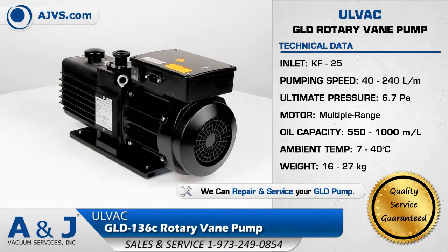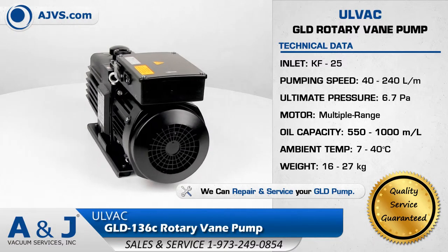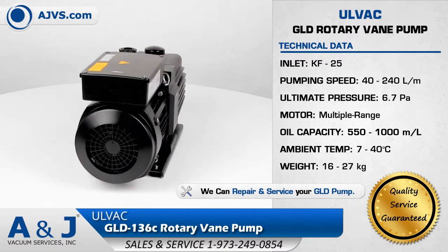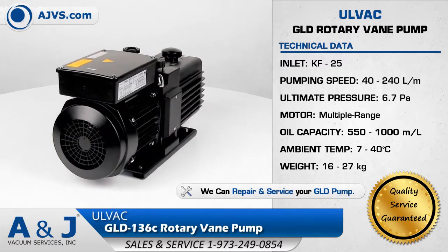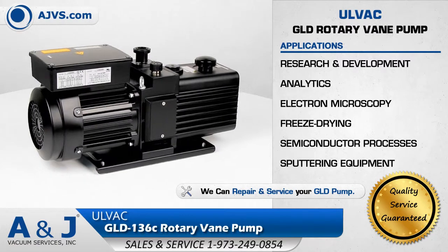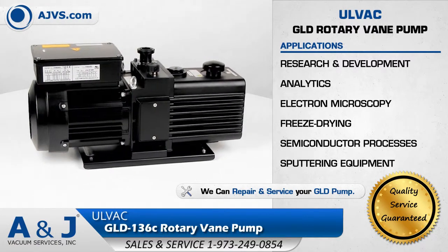Making it an efficient rotary vane pump for today's most demanding work environments. The Olvac GLD Direct Drive Rotary Vane Pump is a highly reliable and low-maintenance high vacuum solution for applications in research and development, analytics, and electron microscopy.